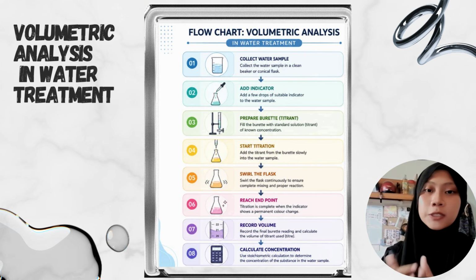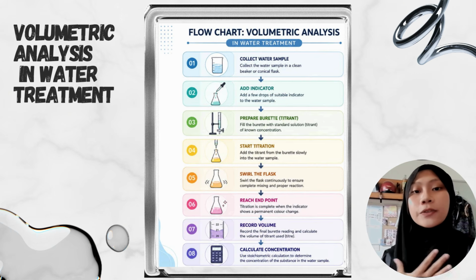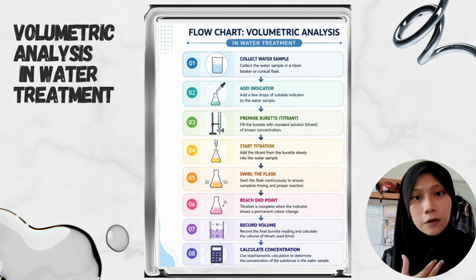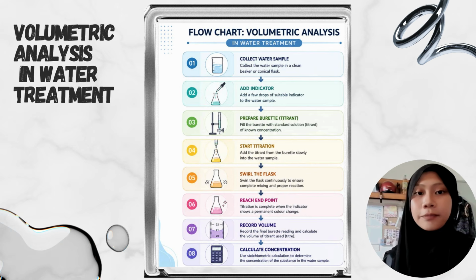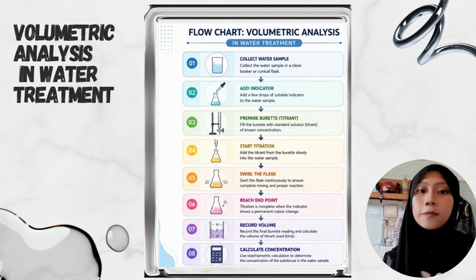Next, I'm going to explain to you how volumetric analysis occurs in water treatment. The procedure is as follows. First, collect a water sample. We collect a water sample from the river and add it into a clean beaker or conical flask.